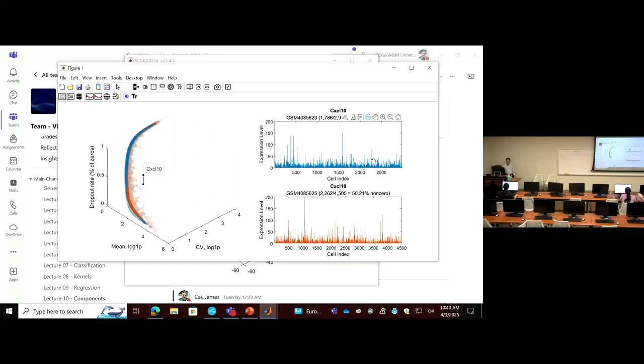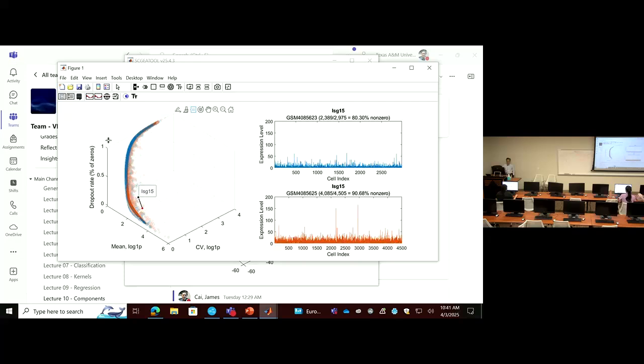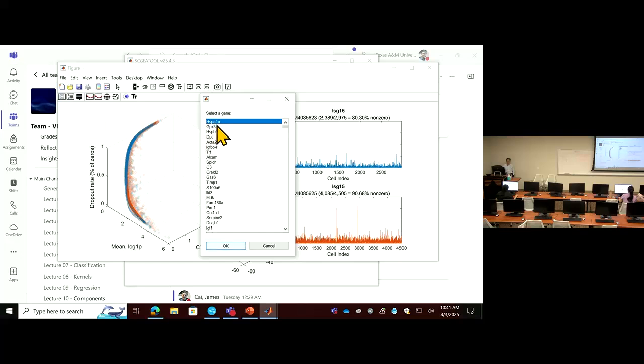The locations are very similar because their profile looks similar in these two samples. So we only consider as interesting a gene which has a significant difference in its variability change. Then we can try different samples, this, that. So you can click basically to find which gene differs very much. You can get it from the list. So this will be the top one. We show the most difference.